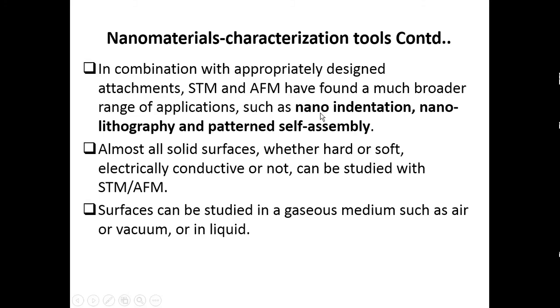It is very widely used for surface thin film measurement on nanoscale. The surface characterization is done with the help of nano indentation. So nano indentation testing is usually done on surfaces which are formed with nanoparticles or nanofilms.